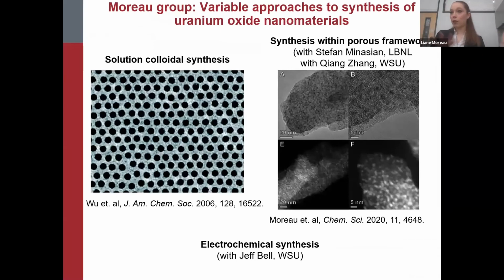So now I would like to switch gears a little bit and talk about what we're working on in my group at Washington State subsequent to that study. And I think that they're not entirely separate. Not all of our work is on uranium oxides, but we are still doing work on uranium oxides. I've dedicated myself to trying to solve some of the issues that we had with the XAFS analysis in order to simplify our work moving forward with all of these complicating effects. And so there are 3 different routes in which our group is currently trying to work on development of these particles at multiple sizes.